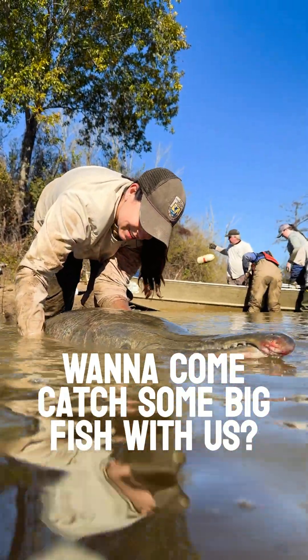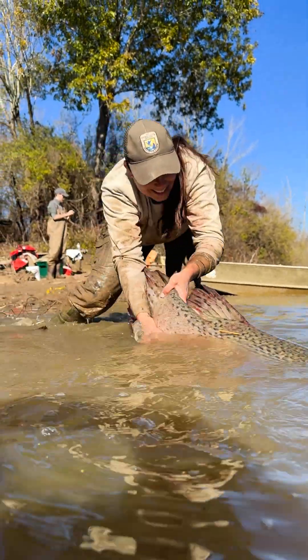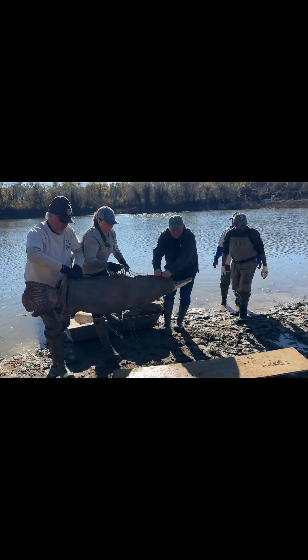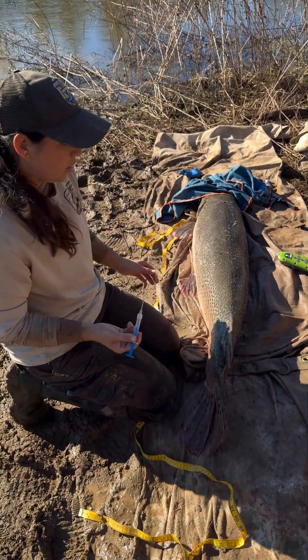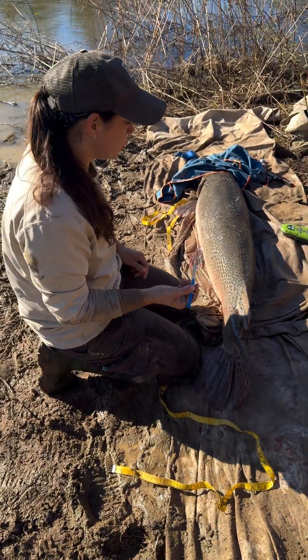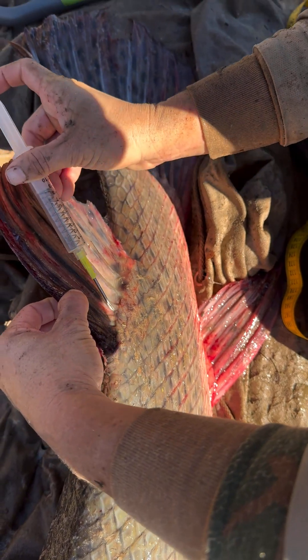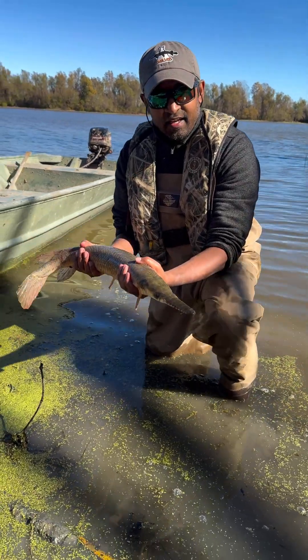From the scale we'll get a good weight. We're going to inject a passive integrated transponder, or PIT tag, into the fish. This is the exact same process as how your pet gets microchipped. Here we have a spotted gar from a floodplain lake in Mississippi.